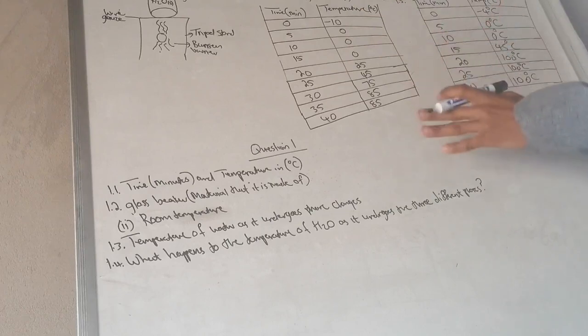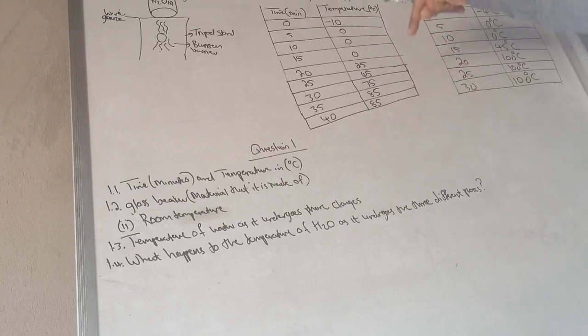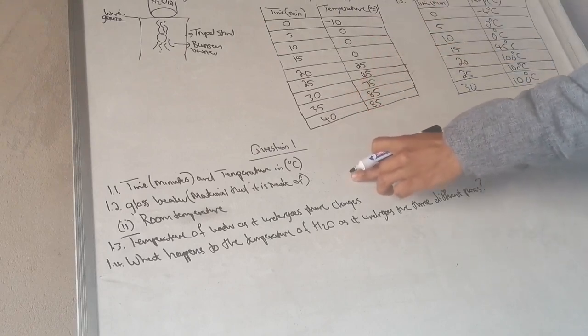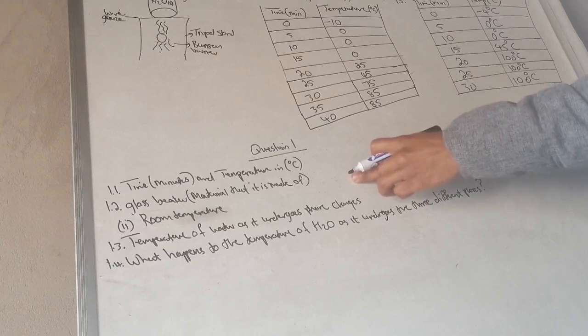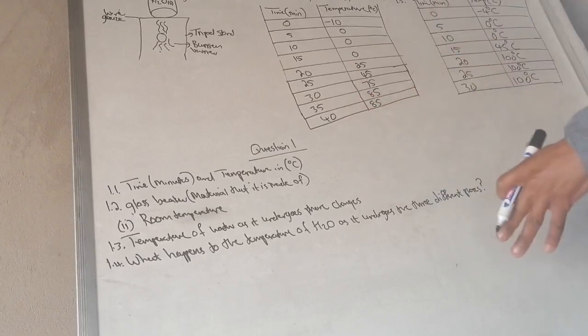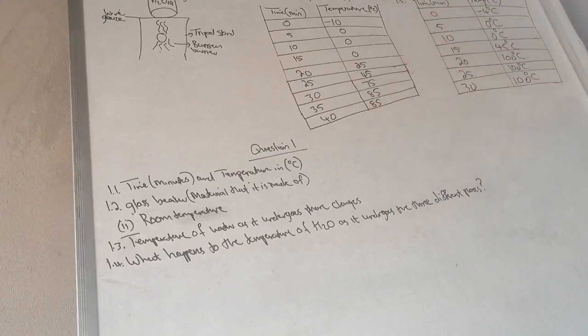And we should have never stopped before water was boiling, so that we can know that it boiled maybe at 55, or maybe it boiled at 1 hour and 5 minutes. We needed that data in order to plot the graph.